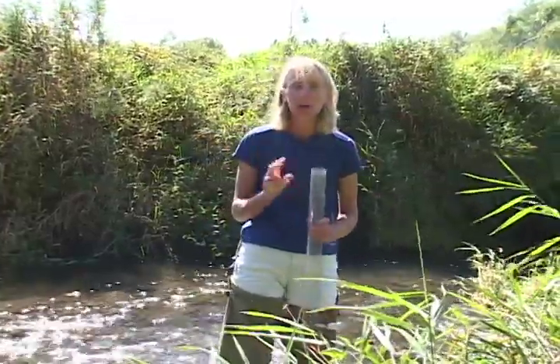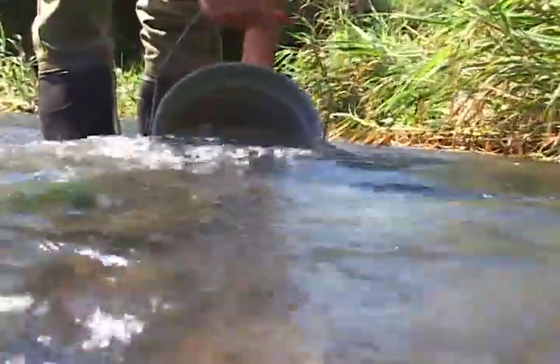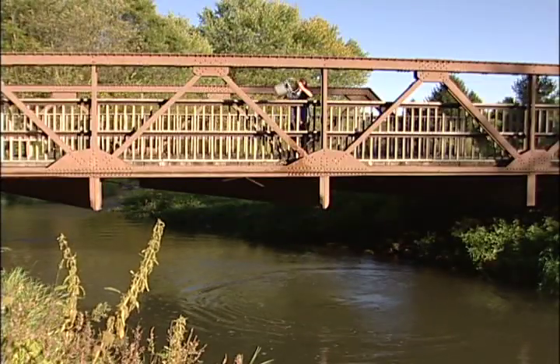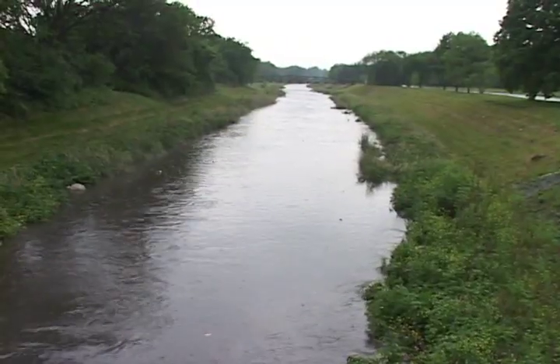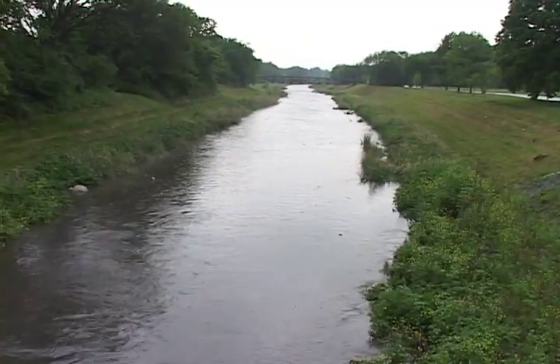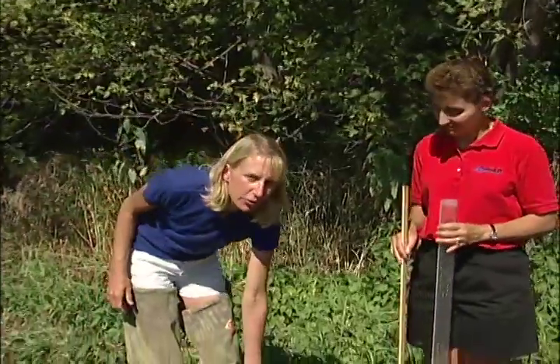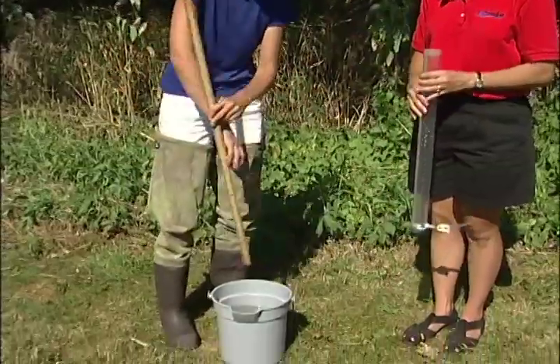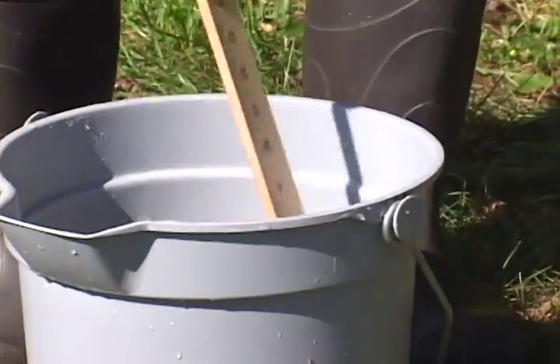You're going to do this two times. The second way to collect a water sample for turbidity is to use a bucket. This method is preferable if you can't enter the stream due to deep water depths or if there's recently been a storm event and it's unsafe to enter. If you collected your sample in a bucket, the first thing to do when you get back on shore is to use a stirring stick to make sure all the sediments are still suspended in the water.